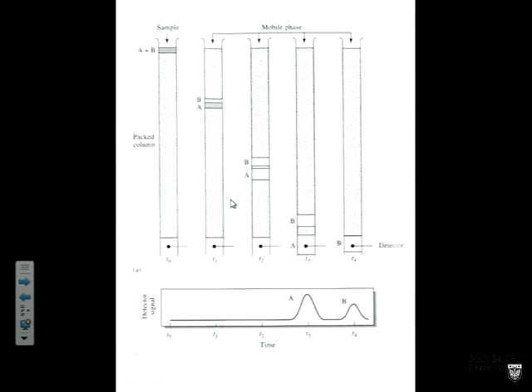As we work down, the bands gradually separate more. A and B now in the third figure are becoming fully separated. And eventually we can have pure A coming off the bottom of the column, and then in a separate flask we can collect pure compound B.